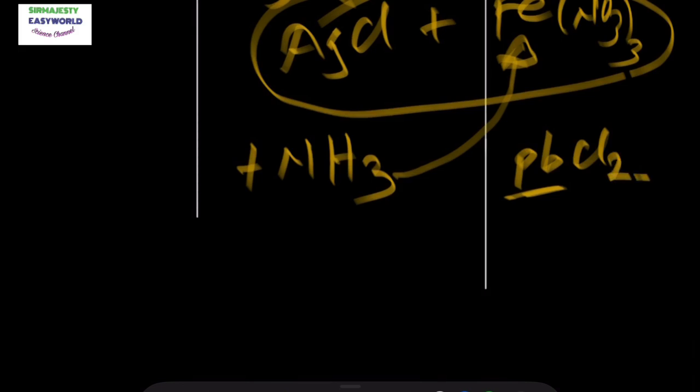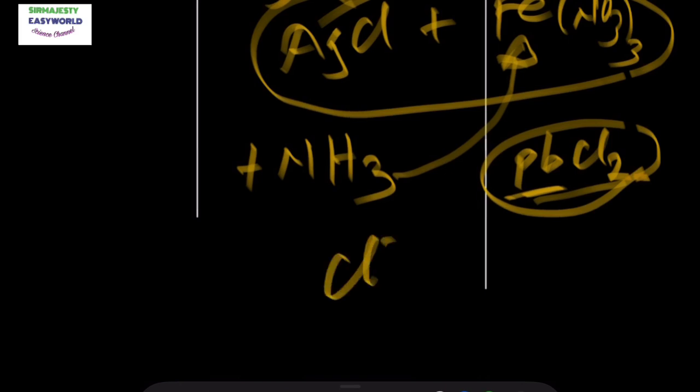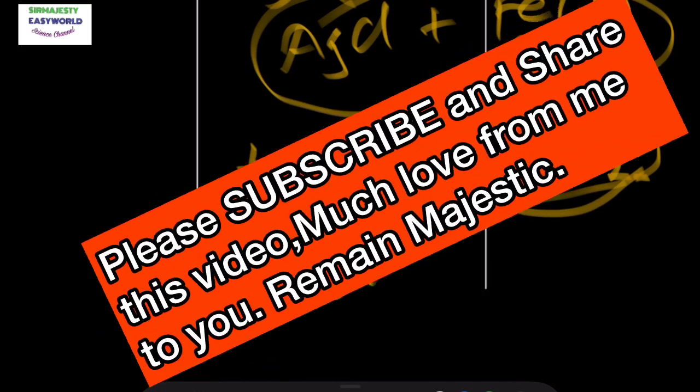So if there will be tests for chloride ion, they might have told you that C is a lead 2 compound. That's the only way. So that when they now tell you add C to the D and heat and allow to cool, we are now aware of lead 2, so that this compound will form, which is soluble in hot water and insoluble in cold water. But when they mention chloride ion without telling you what D is, we now use this chloride to confirm the lead. So that's it.